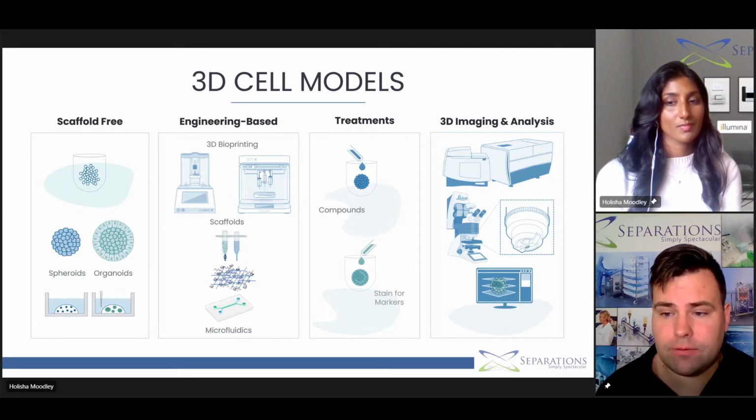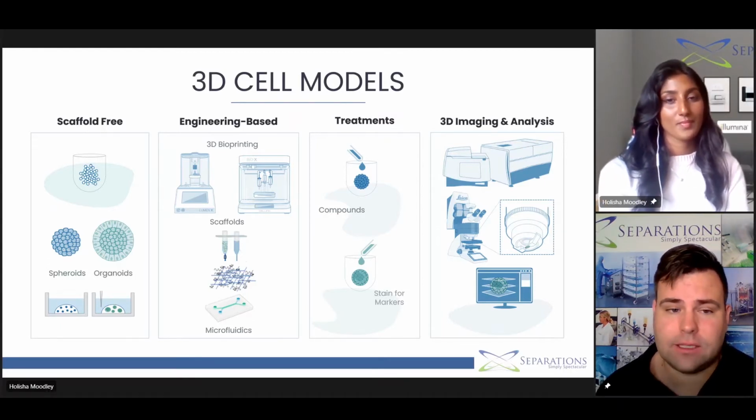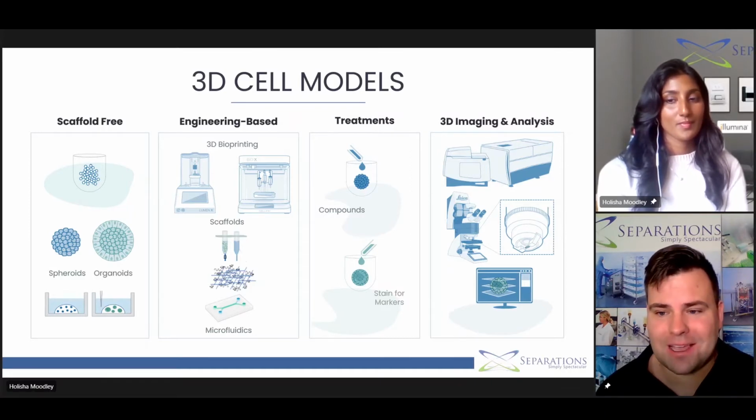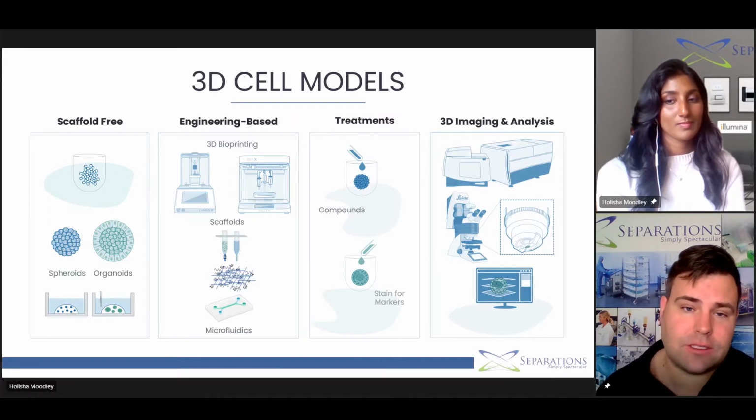It will be some time before we see animal models maybe being removed. There are some exemptions, when it's a very specific type of model or drug development cycle. But it's an interesting space. It'd be great to see that this just gets better and better, the technology, and minimizes the risk to patients when they model in these new candidates for clinical work.